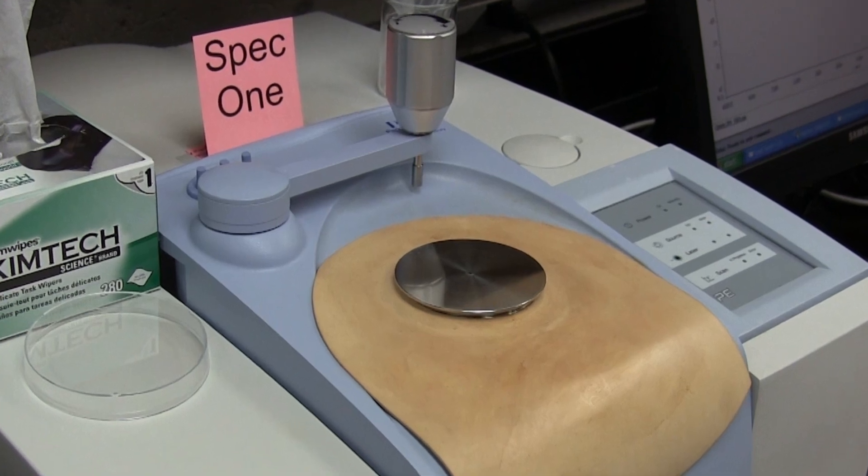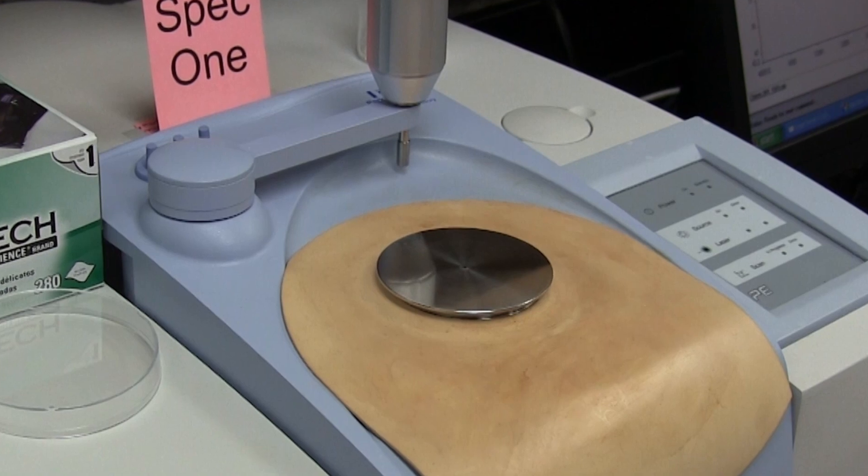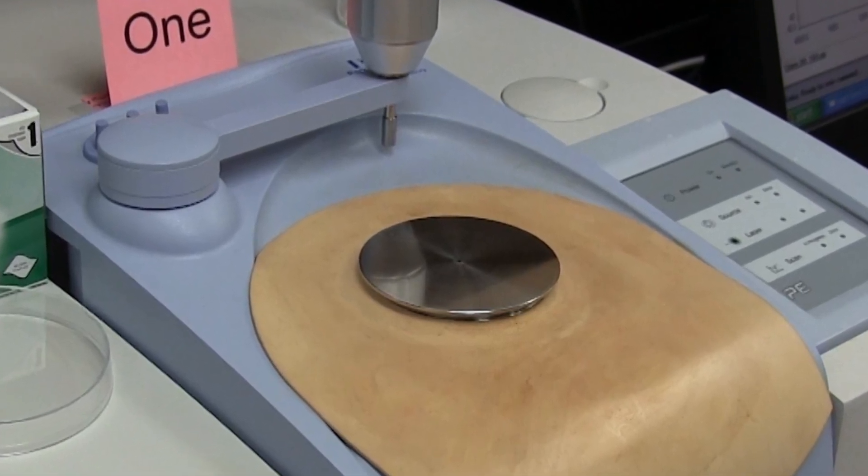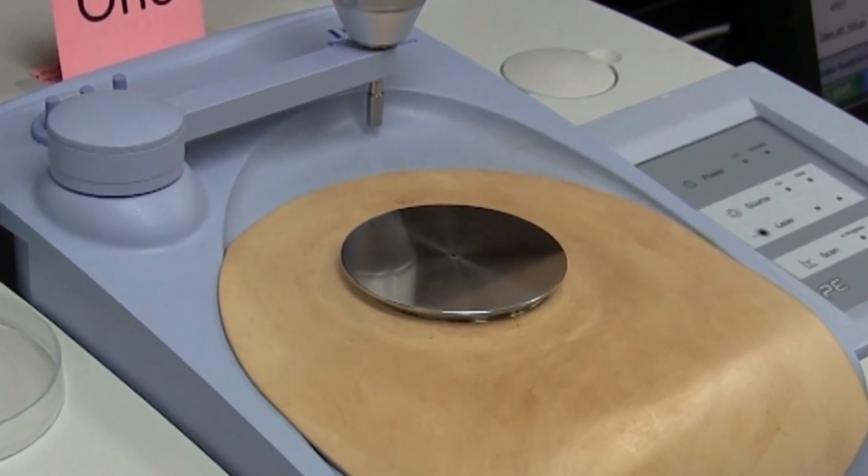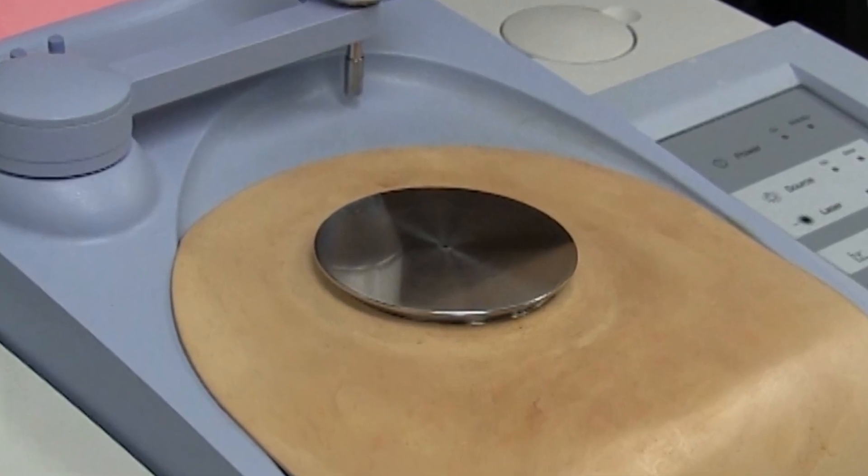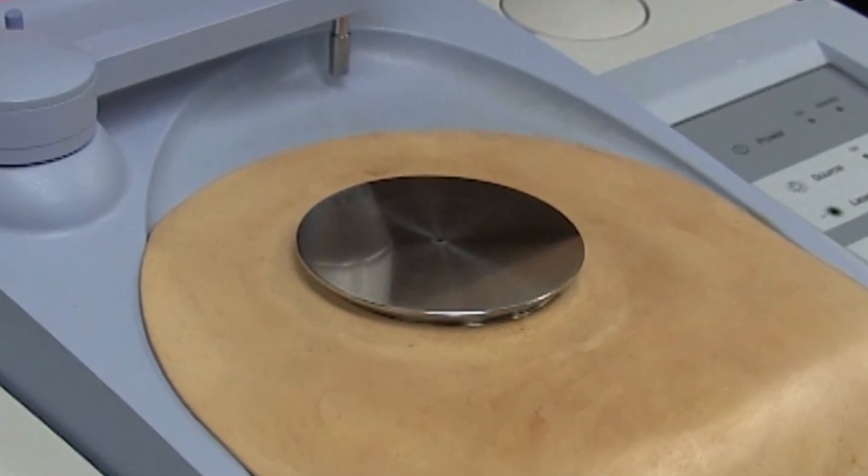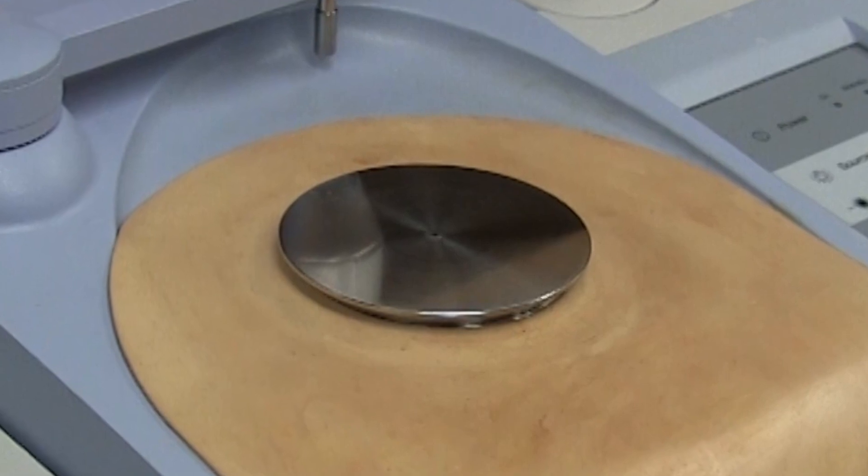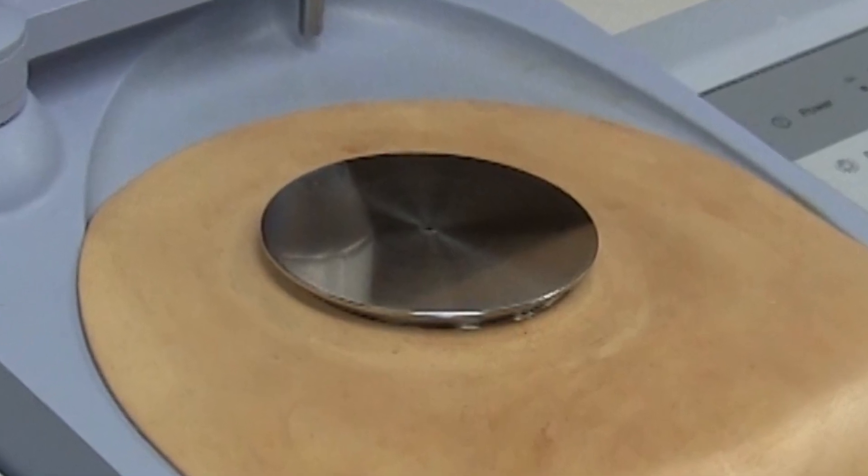The ATR consists of a diamond crystal in the center of this circular mounting plate. The liquid or solid sample is placed over the surface of the crystal, and the IR beam is directed from below into the sample to a depth of only one to two micrometers.